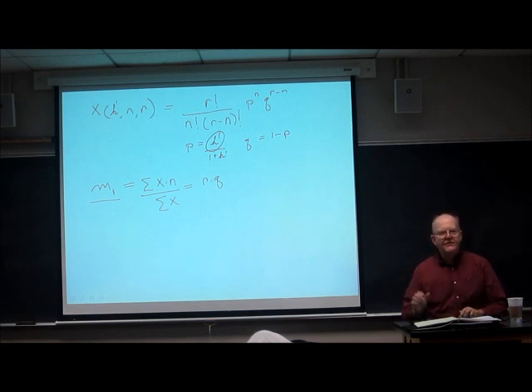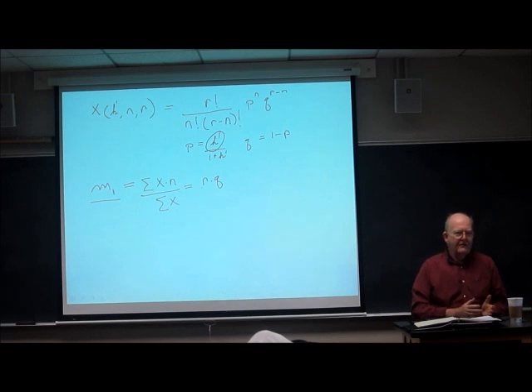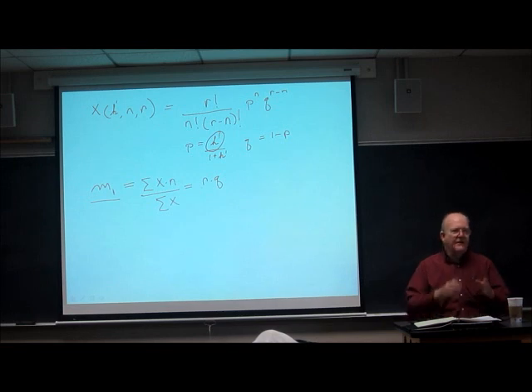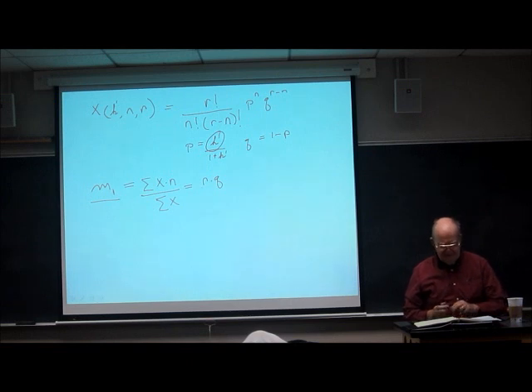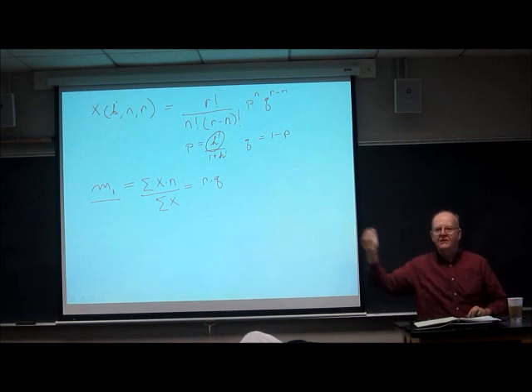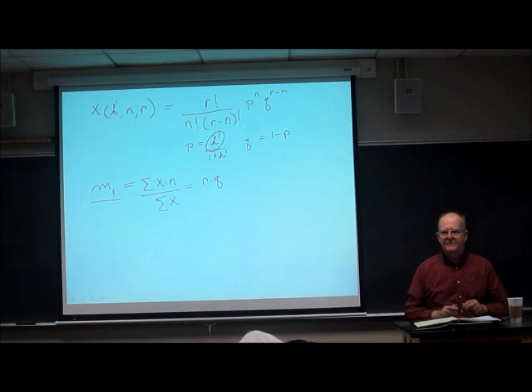So if you don't do any transfers, r is zero. Doesn't matter what fraction you're dealing with, zero times that fraction is zero. The center of mass, if you don't do any transfers, has got to be in the first tube, because everything's in the first tube. No ifs, ands, or buts about that. As you do more transfers, the center of mass shifts linearly, i.e. with the first power of the number of transfers.